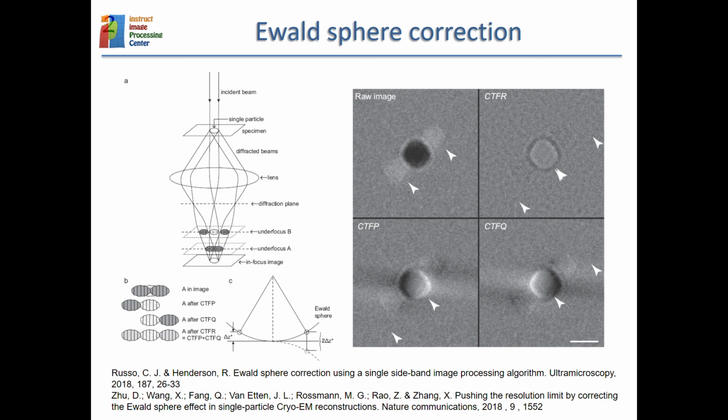And the idea here is that it is not just the plane projection that gives rise to this central slice theorem interpretation, but that the Fourier coefficients of the 2D image are located along a surface, and in this theory this surface is a sphere. So they are not coming from a plane in the 3D Fourier space, but from a sphere in the 3D Fourier space.